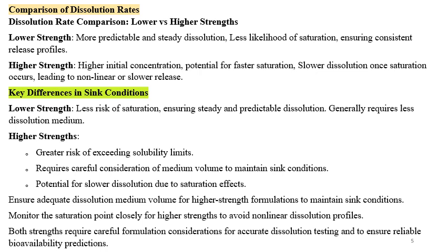So we should ensure adequate dissolution medium volume for higher strength formulations to maintain the sink conditions. We should monitor the saturation point closely for higher strength to avoid nonlinear dissolution profiles. Both strengths require careful formulation considerations to accurately perform dissolution testing and to ensure reliable bioavailability predictions.